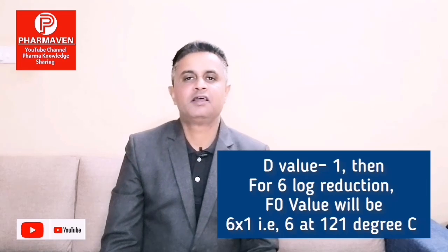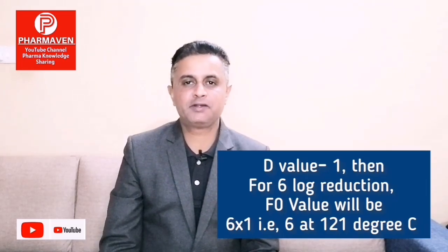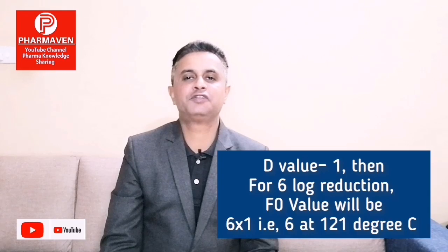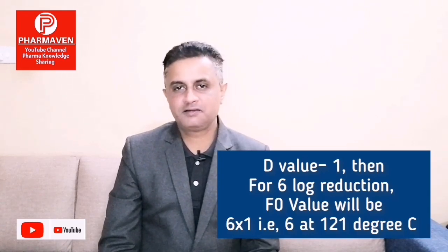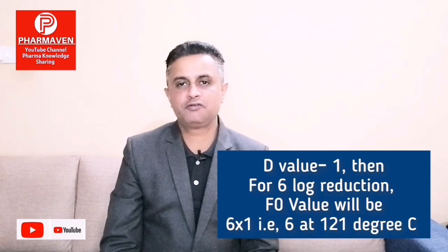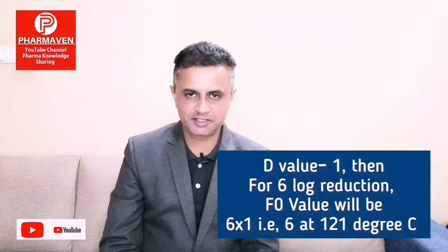So how do we calculate the F0 value for a specific biological indicator? If my biological indicator BI spore population is 10 to the power 6 and I want a 6 log reduction, and the D value is 1 at 121 degrees, then 6 multiplied by 1 is equal to 6, so the F0 value will be 6 at 121 degrees Celsius.